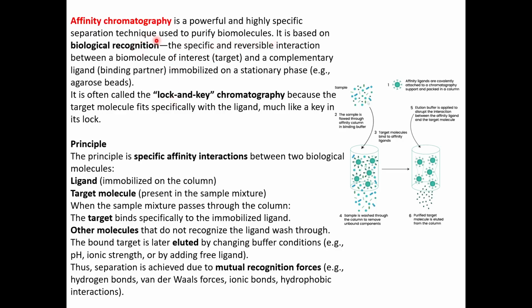So it is basically used to purify biomolecules, and it is based on the ligand and target specific interactions. So it is based on the biological recognition, that is the specific and reversible interaction.